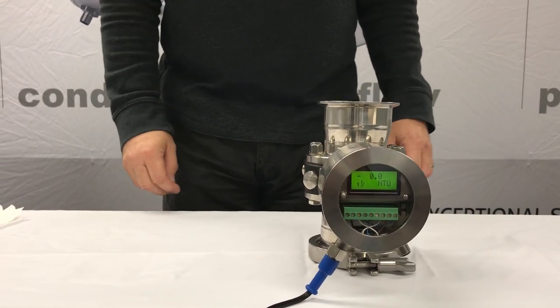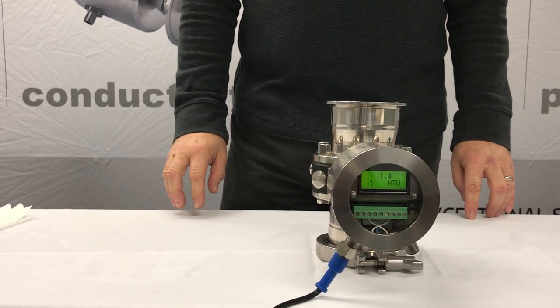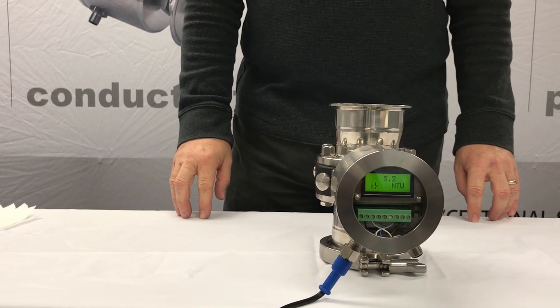The sensitivity of the ITM-4 can detect 10 parts per million of dairy product's presence in water.